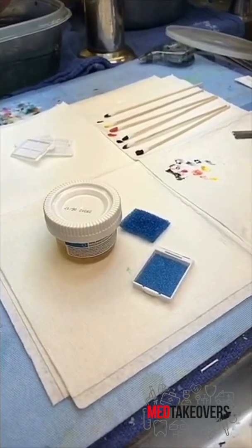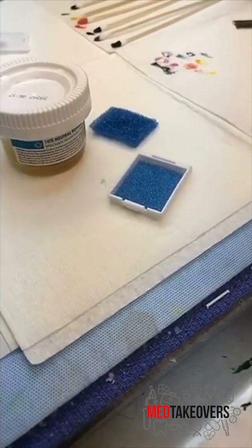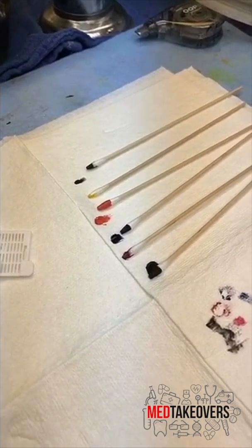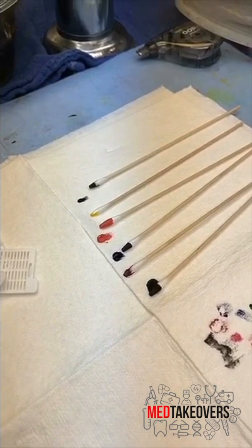The next step is we open the container, measure the piece of skin, and then cut it up and put it into this little cassette here for tissue processing. We usually add some different colored inks to the outside of the tissue so we can see where the actual tissue edge is and to help us avoid mismatched specimens.